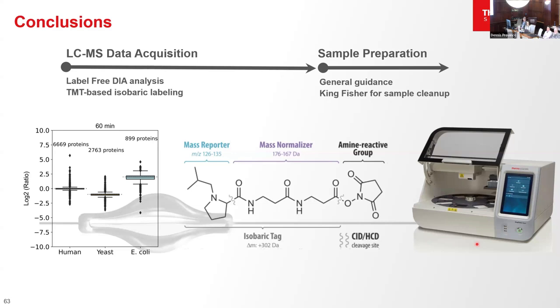That may or may not correlate with the overall protein abundance that you're going to measure by mass spectrometry or maybe even SOMA. So they very likely are measuring something because it's fairly reproducible, but what you're actually measuring is not as clear.